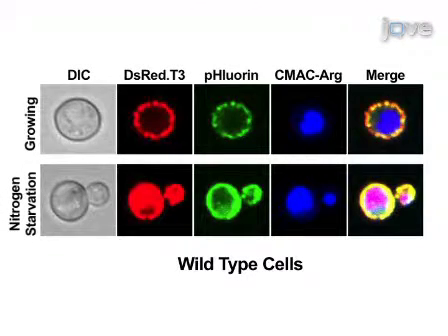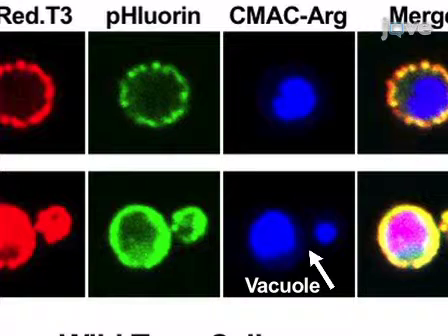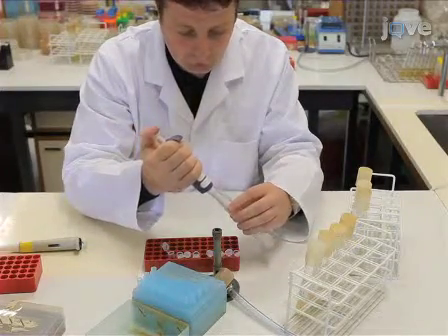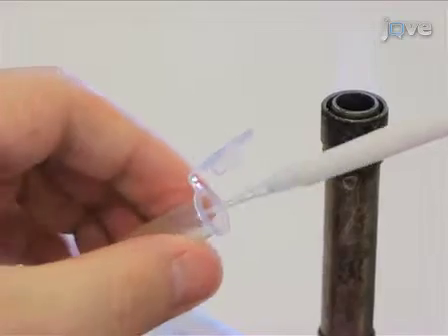After the induction of mitophagy, it is useful to confirm the delivery of MT-Rosella to the vacuole under the fluorescence microscope. The vacuole can be located by labeling using a coumarin-based blue fluorescent dye such as 7-amino-4-chloromethyl-coumarin-L-arginine-amide, CMAC-ARG for short. Labeling with CMAC-ARG does not need to be performed routinely, but is recommended for those not familiar with the location and appearance of the vacuole in yeast. To begin, transfer 1-milliliter samples of each culture into separate 1.7-milliliter snap-cap plastic centrifuge tubes, then add CMAC-ARG to each tube.